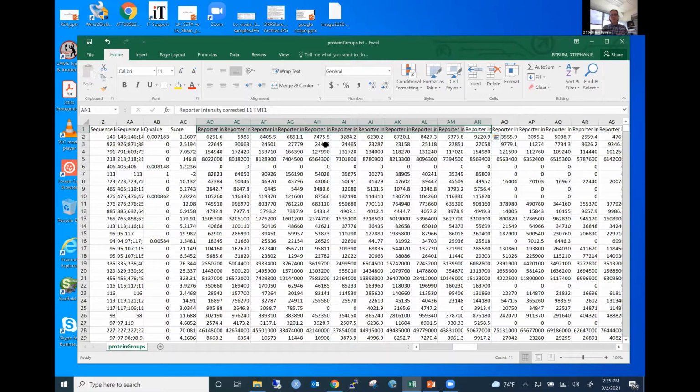So you want to be careful when you're, the core helps take care of that. They do the sample labeling, and we make sure that we have the right sample with the right number so that we can make sure that your sample names match up to the right information. So there's a process in place for keeping up with all of that information.